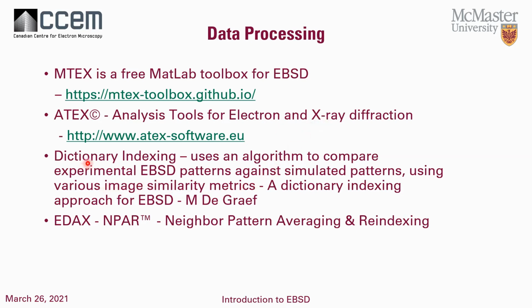There is a method for analysis of patterns where you're taking simulated patterns and comparing them to experimental data. So a lot of mathematics involved in that and a lot of calculations. But that has been used to look at very poor patterns and actually determine orientations.